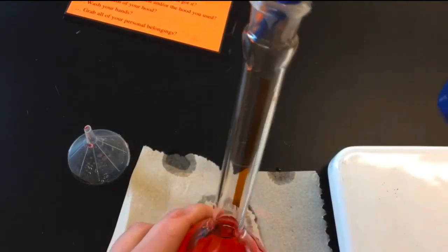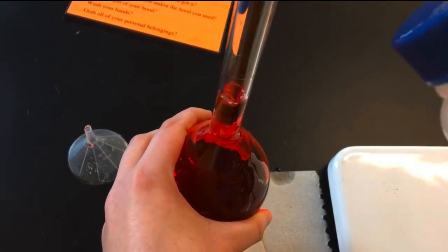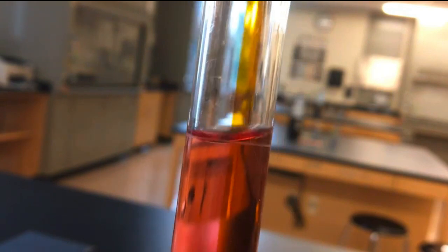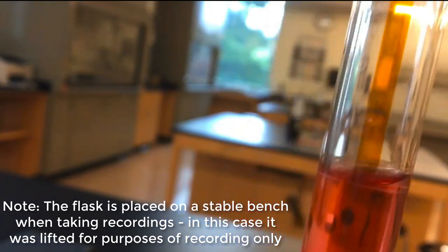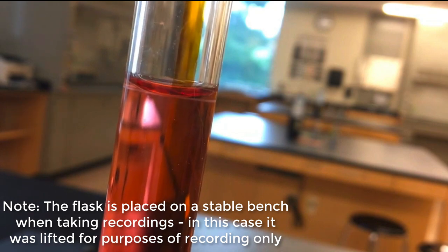So you're going to want to fill. We're getting close to the line, so we'll go very slowly. Ideally, when we do all of these, we want the meniscus just to be touching the line, like here. Sorry, can't hold it still. As you can see, it is there.